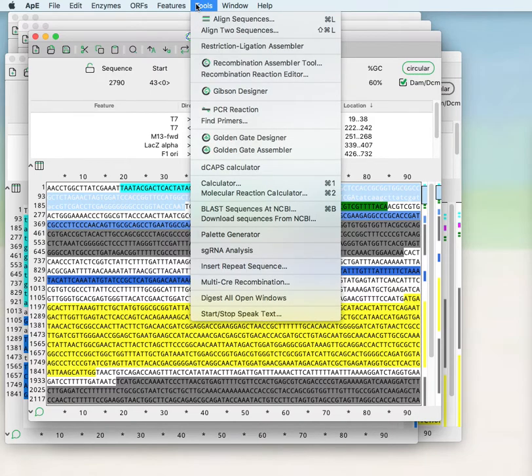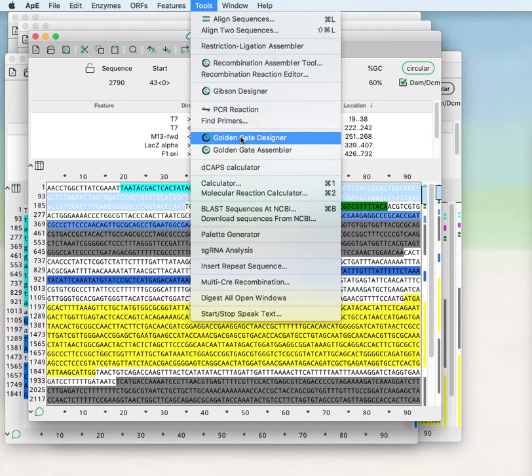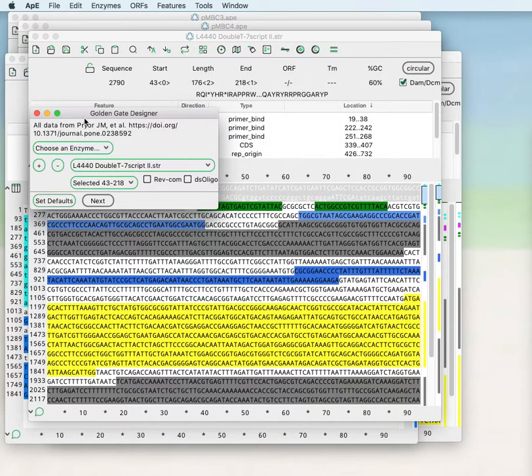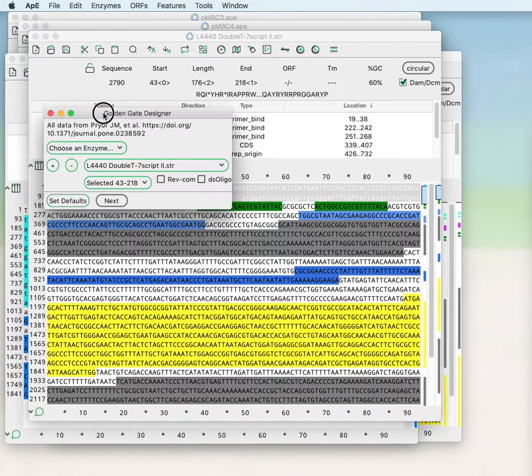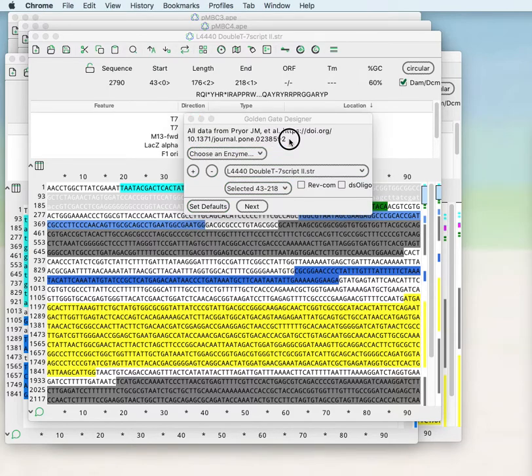Golden Gate reactions use type 2s restriction enzymes to assemble multiple fragments together in a scarless reaction. The Golden Gate designer designs the reaction to generate PCR primers to generate PCR products that can be used in a Golden Gate to assemble as many as 35 fragments.